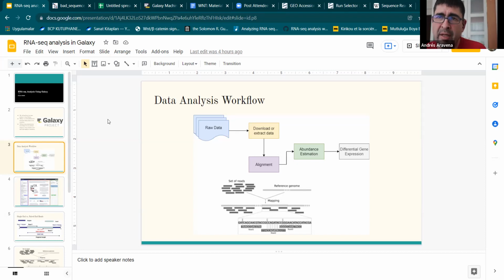If your data is private, if you are doing something that you don't want to make public, that is one of the reasons that I tend to use my own servers. But the point at the beginning is, as Cemre said, this is biology proof. You don't need to know. I mean, you can do it with the mouse, not with the keyboard. That is the difference. Anyway, but it's better to have it.